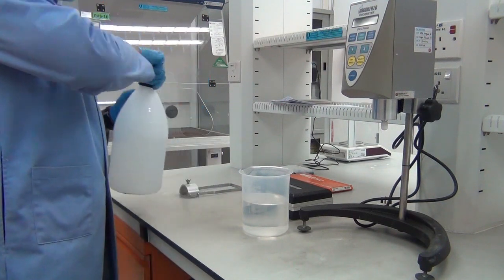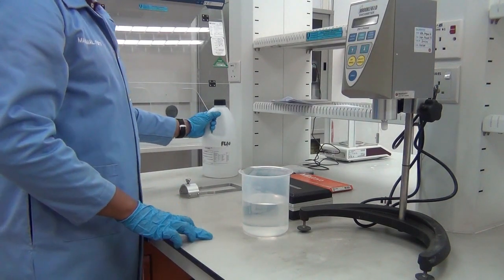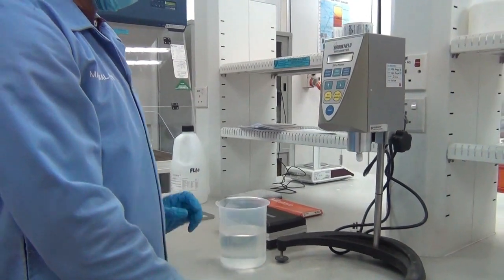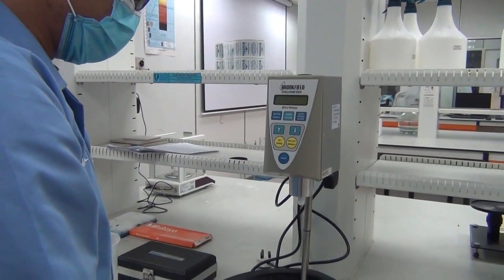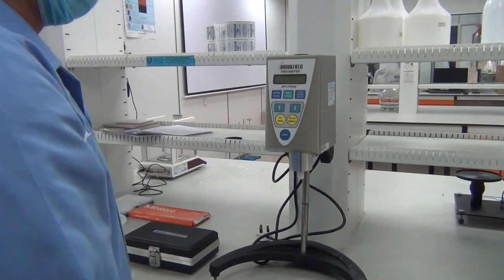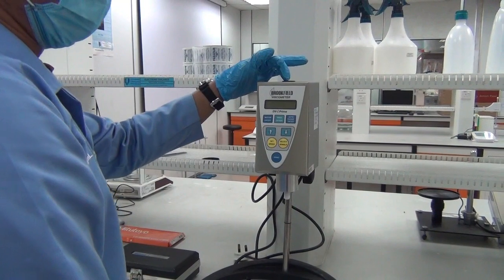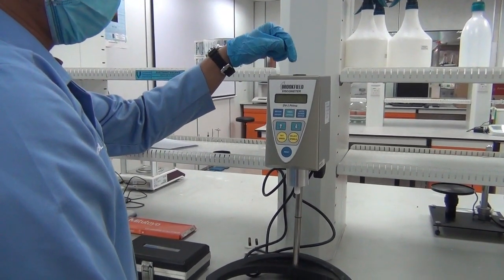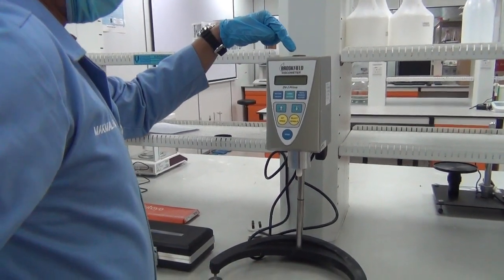So we are done with the preparation of material. Then we check this instrument. How to check this instrument? First, we need to check that this Brookfield viscometer is in the correct position, aligned, with the bubble inside the circle. There is a circle on the top of the instrument where you can see the bubble.